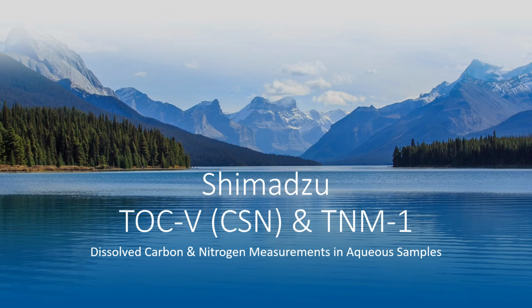This presentation will cover the basics of the Shimadzu TOC-V and TN instrument. This instrument has two components to it. The TOC-V component measures carbon and the TN component measures nitrogen. Both are for aqueous samples only, and we consider the carbon and the nitrogen to be dissolved because they have to go through a filter before they come onto this instrument.